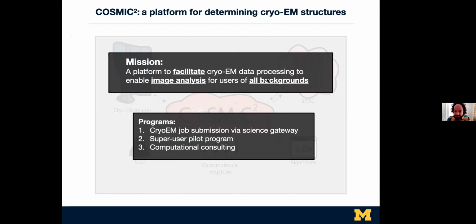And this is why I'm really excited to speak on this platform here, because I think these national center-based approaches of expanding cryo-EM access need the equivalent for computation, and that's what this platform can offer. And so what I'll talk about is what we call a science gateway, which is this website that lets you submit jobs to the supercomputing center. I'll talk about this first, the job submission.